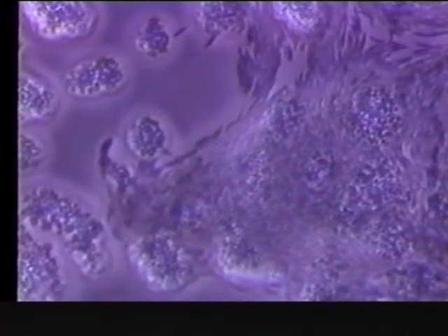The myxobacteria are enjoying themselves, eating the Micrococcus, going towards the next microcolony. See, that cell just zipped right in. Again, almost sideways. Some seem to be gliding in very rapidly, and some seem to be pulled in.